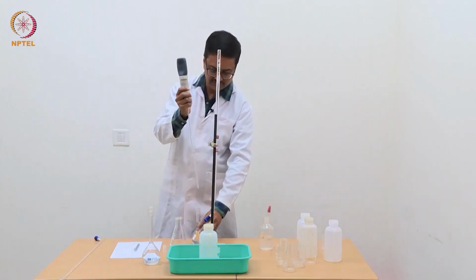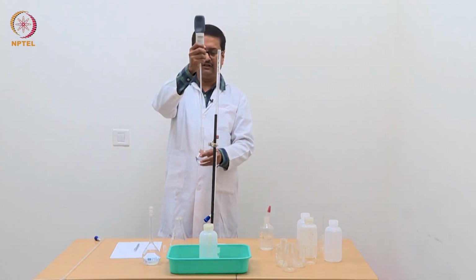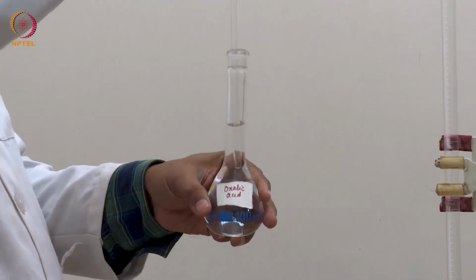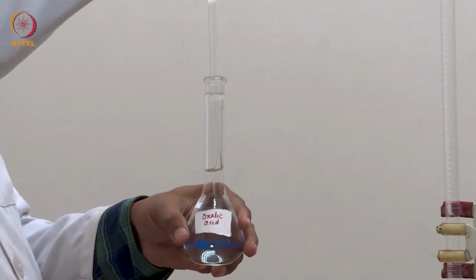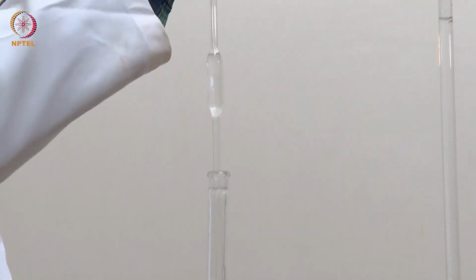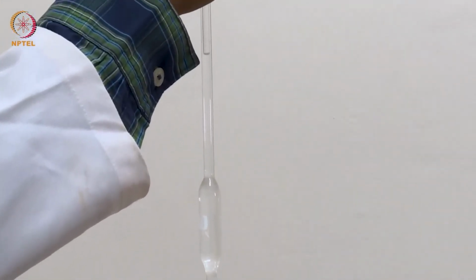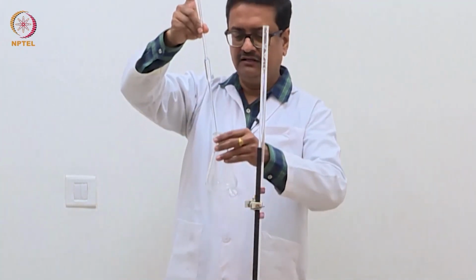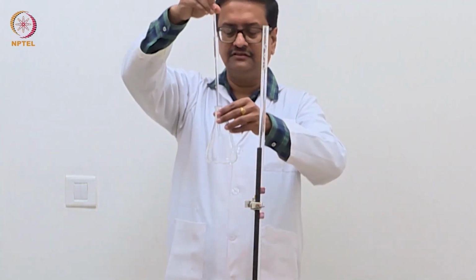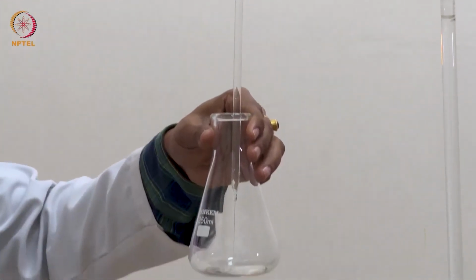And carefully take out the solution in this pipette, and we should pipette out only up to the mark that indicates 10 ml. Release it in this 250 ml conical flask.